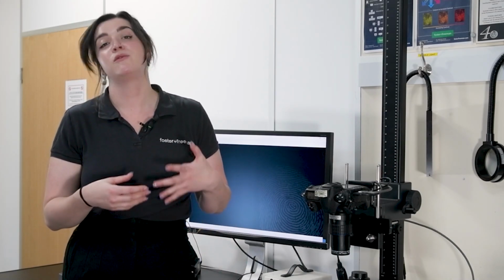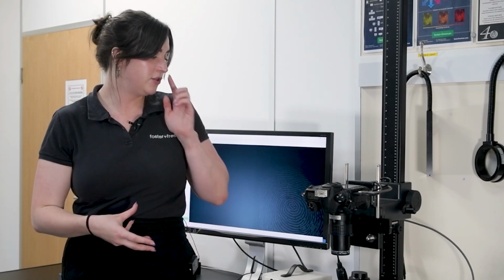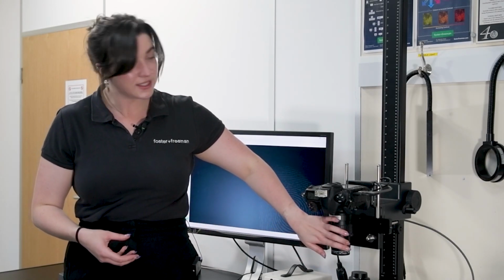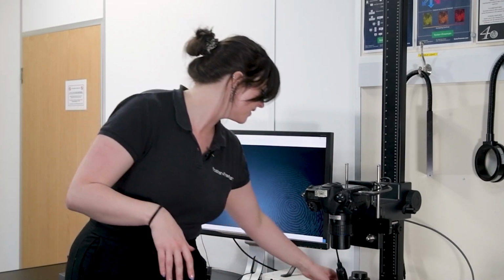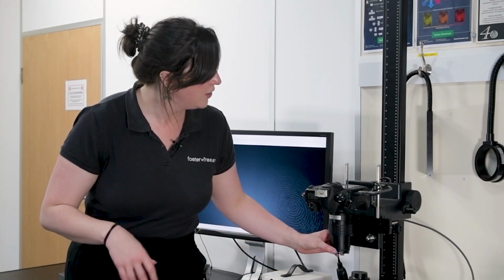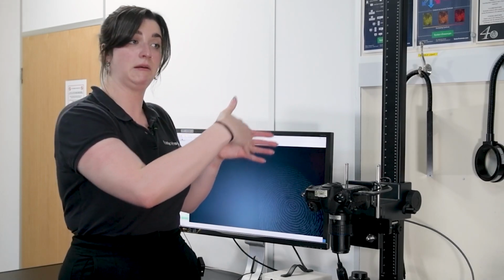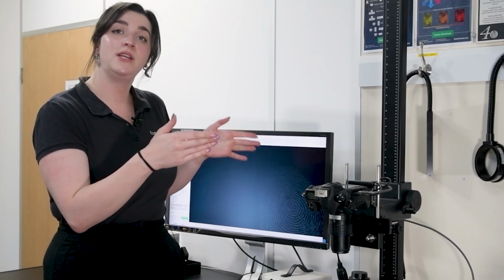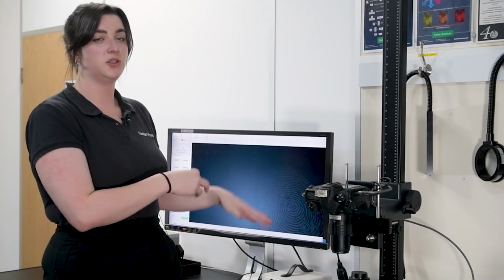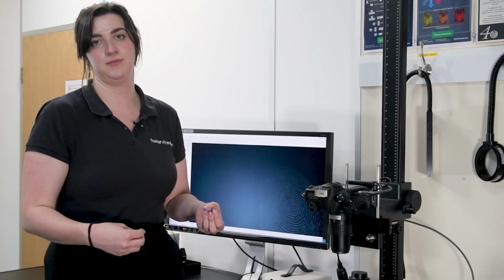So we're going to use reflected long wave UV to photograph these fingerprints. The first thing I have done is made sure that the quartz lens is attached to the DCS, and I'm going to swap my visible filter stack for a UV bandpass filter. All this does is it means that instead of transmitting the visible part of the spectrum, the lens and the filter will only transmit the ultraviolet part of the spectrum. So we're viewing all of those interactions in the UV part of the spectrum rather than the visible.